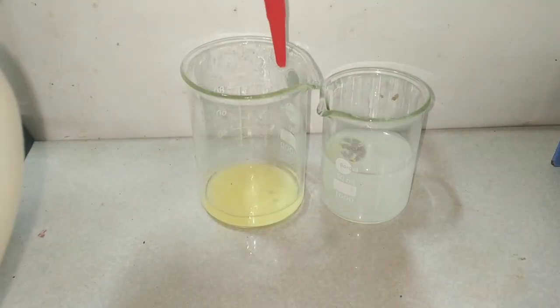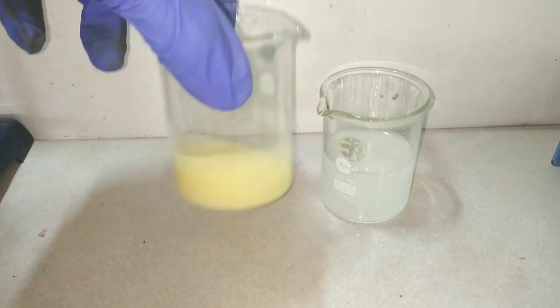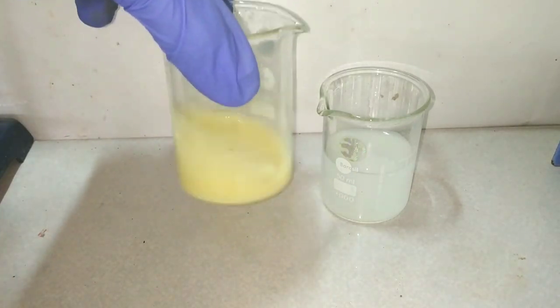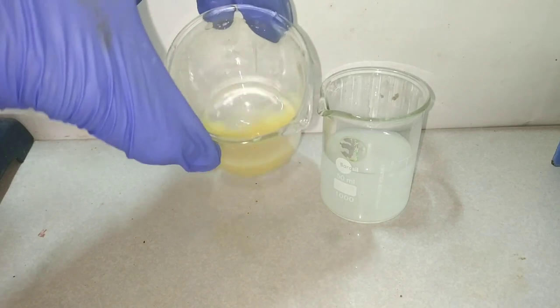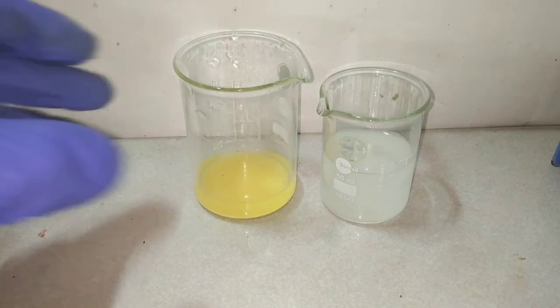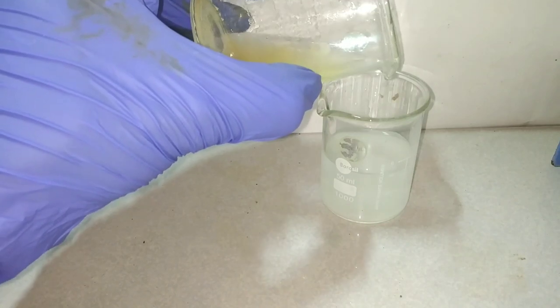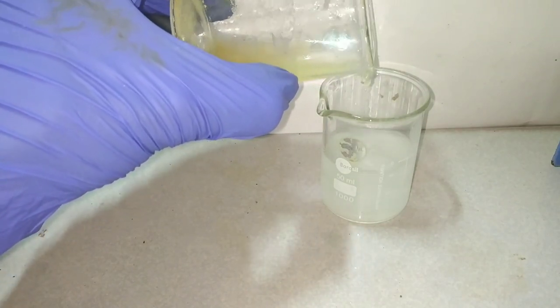That darker color is actually the copper 1 oxide being formed. After washing for a few minutes, the color of the precipitate has turned to a yellow-orange color. That means we are done washing now. We finally decant off that solution and we are left with some copper 1 oxide.